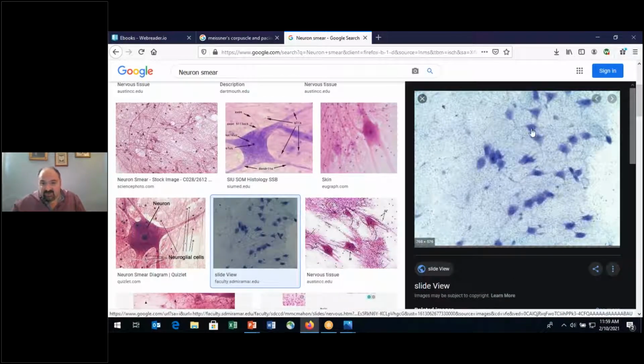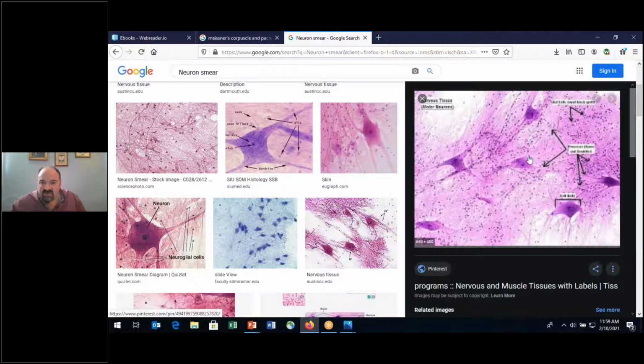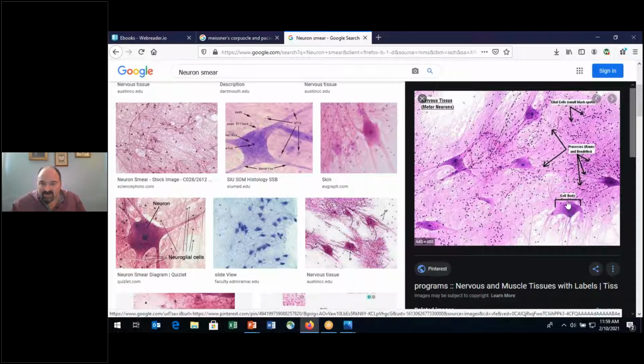These are all nuclei, all nuclei of neurons, okay? So you're seeing the inner portion. So better, here we go. So here's the nuclei present within this structure right here, which is the neuron cell body. So neuron cell body here, here, here, here, right? Containing the nucleus and other structures that would be present in a eukaryotic cell, right?